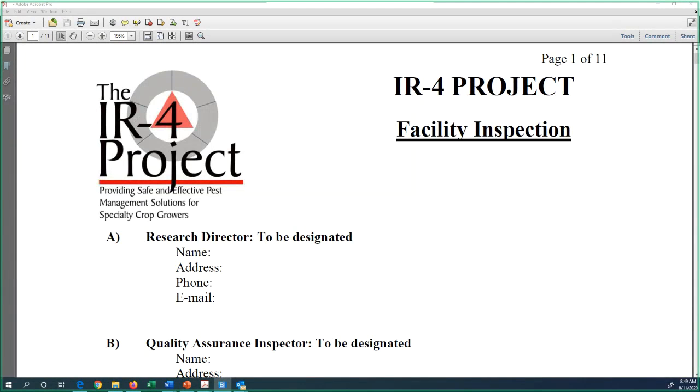And that's really what GLPs are about. It's not simply having faith that you are accredited. It's how you're actually performing during a study, and it's that QA oversight and inspection and documentation, maintaining of those records.